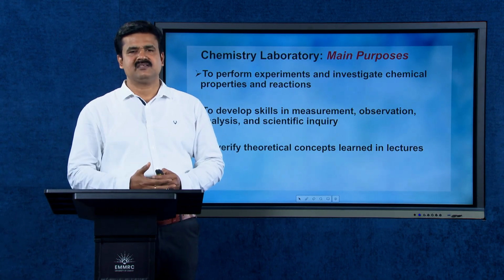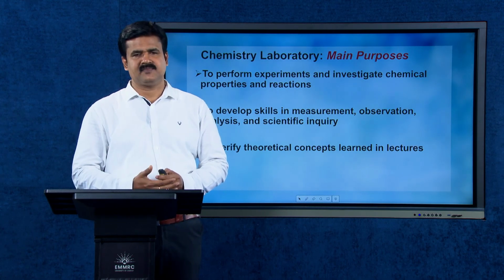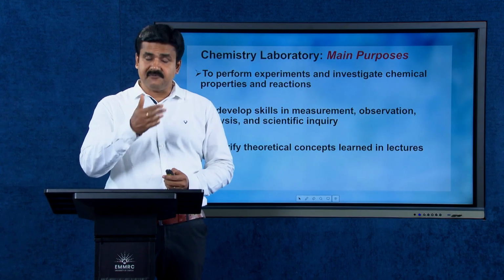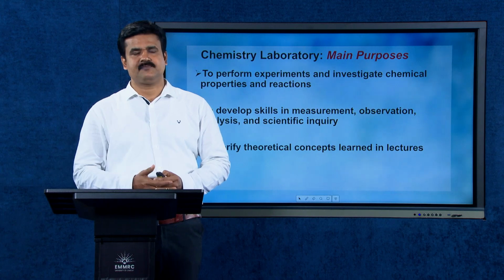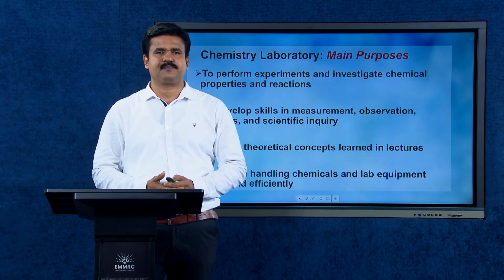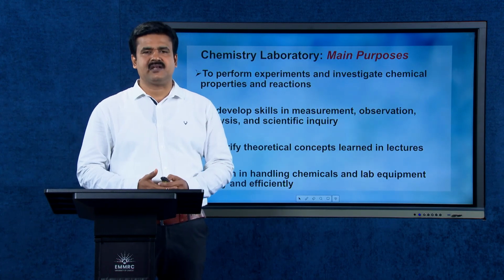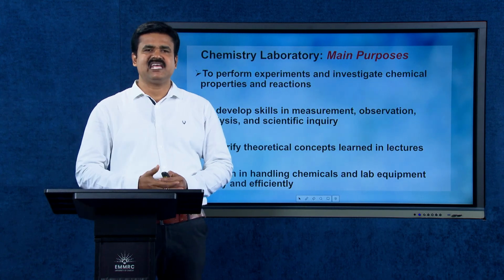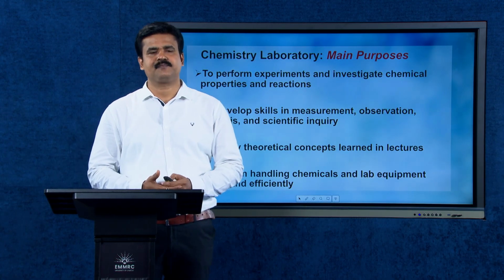You are familiar with chemistry theory classes, where we are studying enormous theoretical concepts associated with chemistry. The verification and the demonstration of all such concepts are performed in the chemistry laboratory. And the chemistry laboratory is used to train in handling chemicals and lab equipment with safety and efficiency.